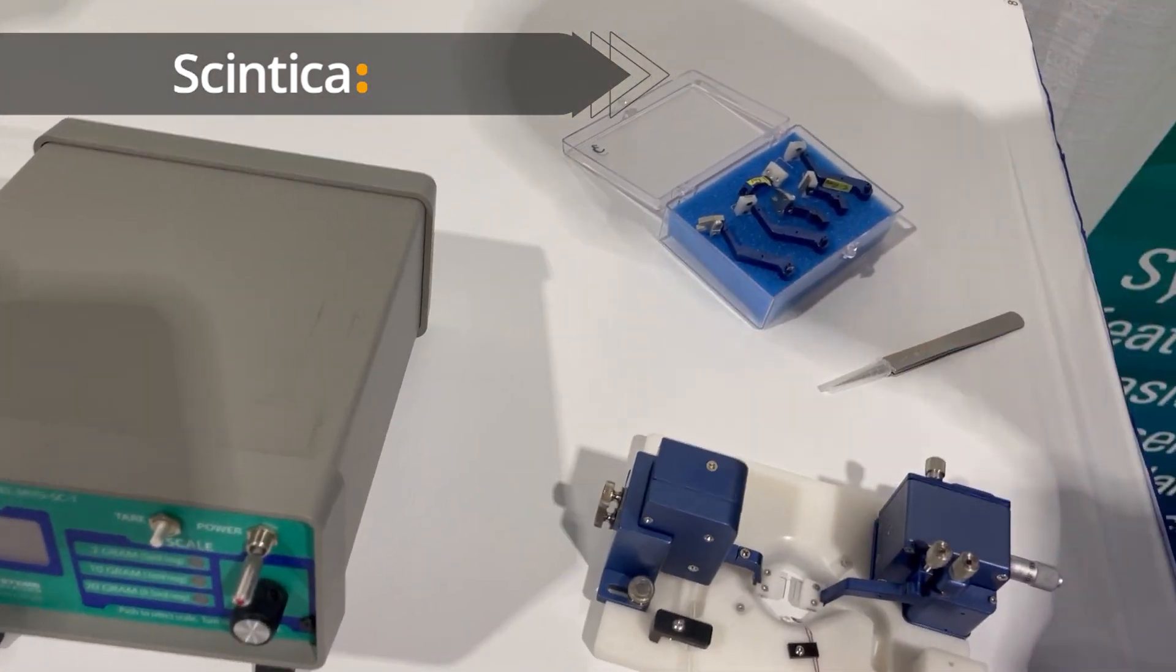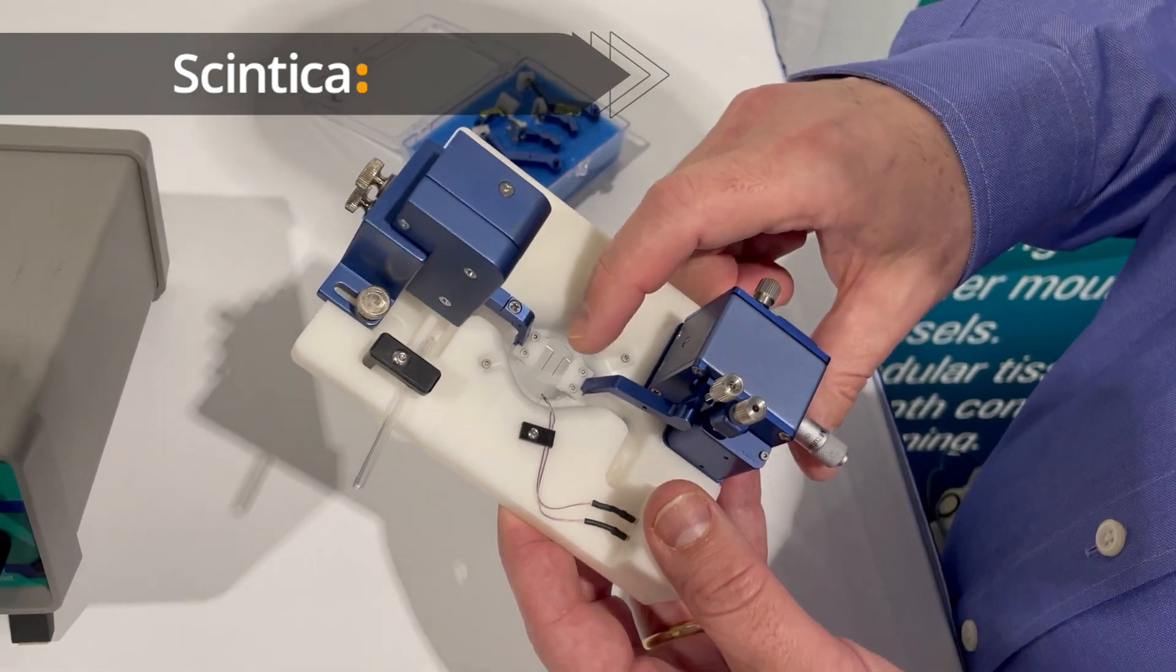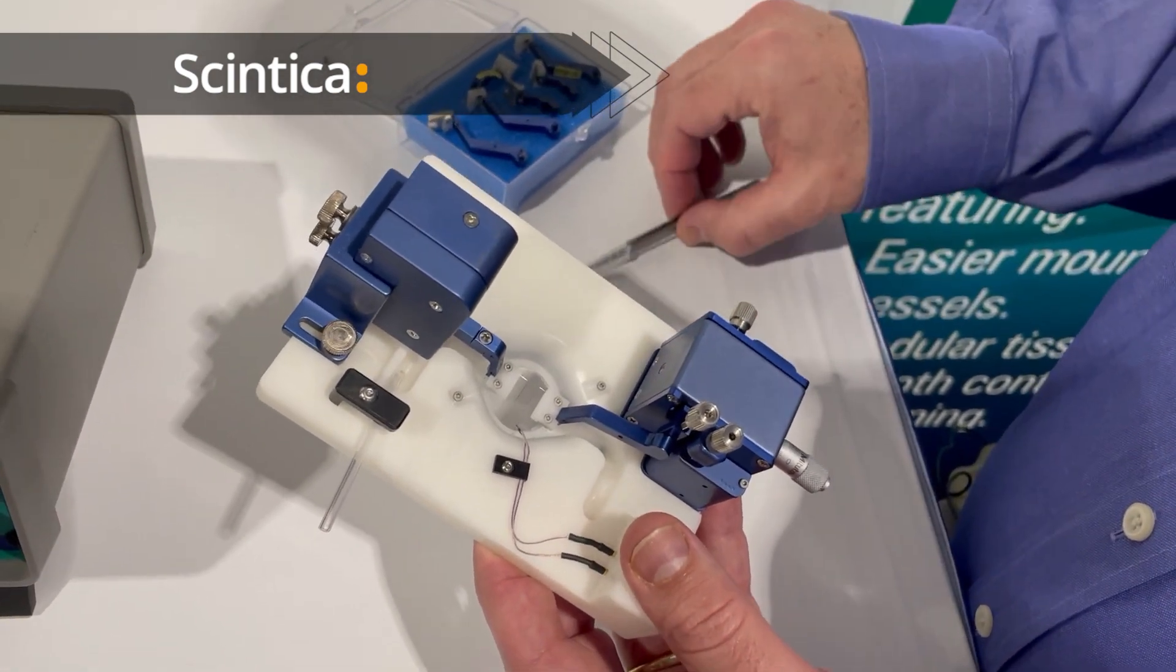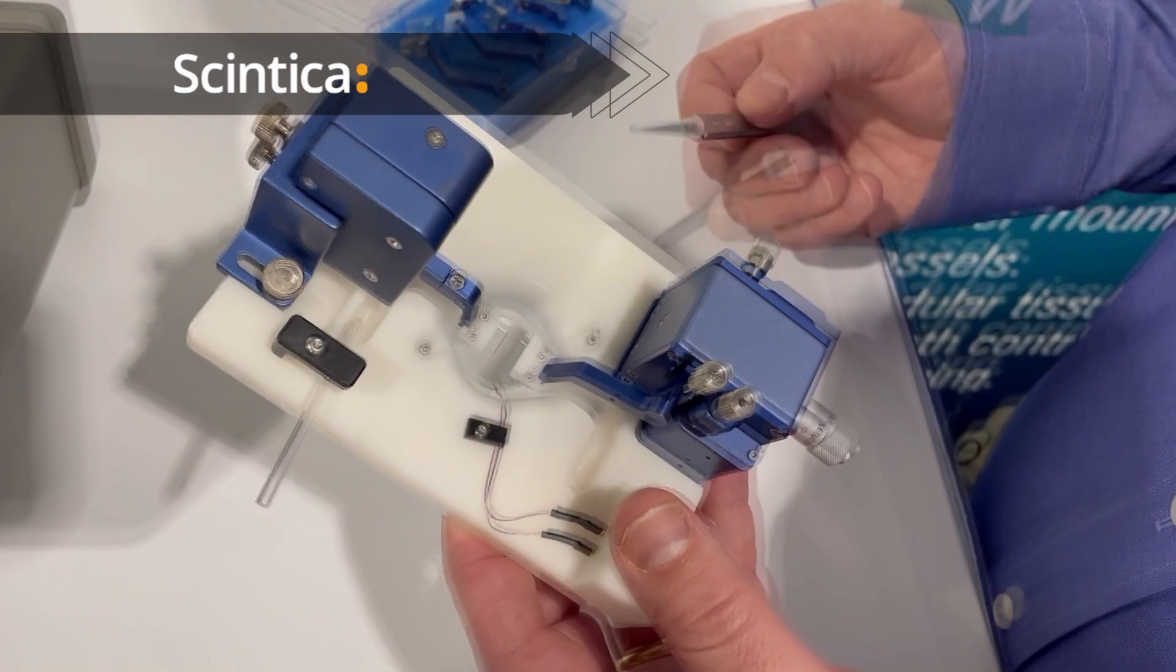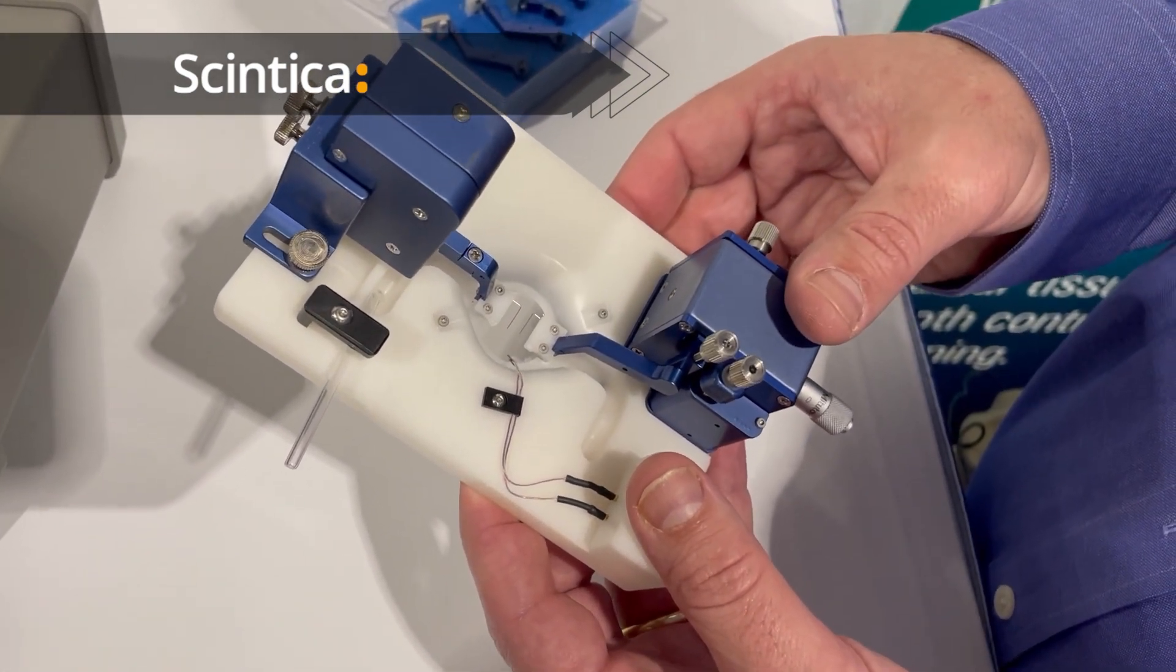We have the bath fitted with our L bars for our ring preparations. But these modular arms can be easily removed. The one on the force transducer is removed with a Phillips screwdriver that comes with the bath.